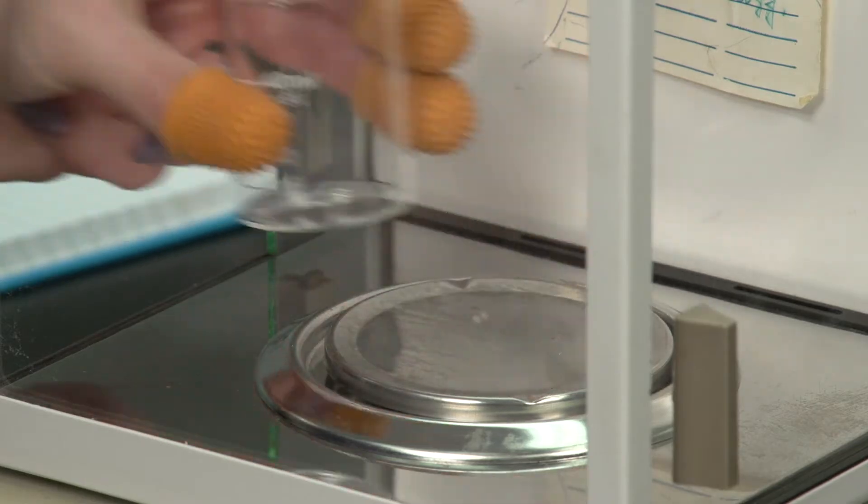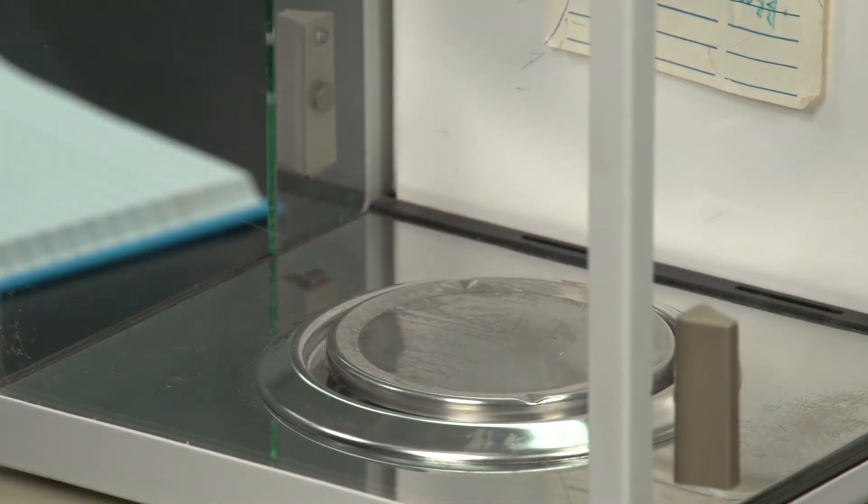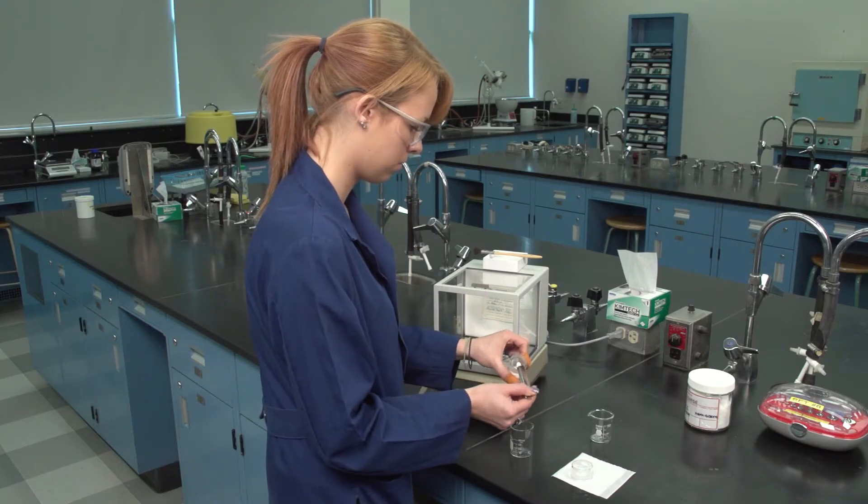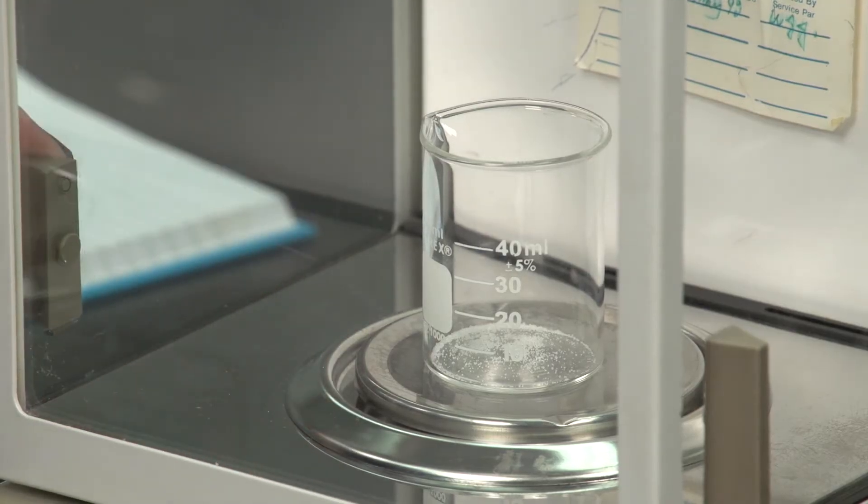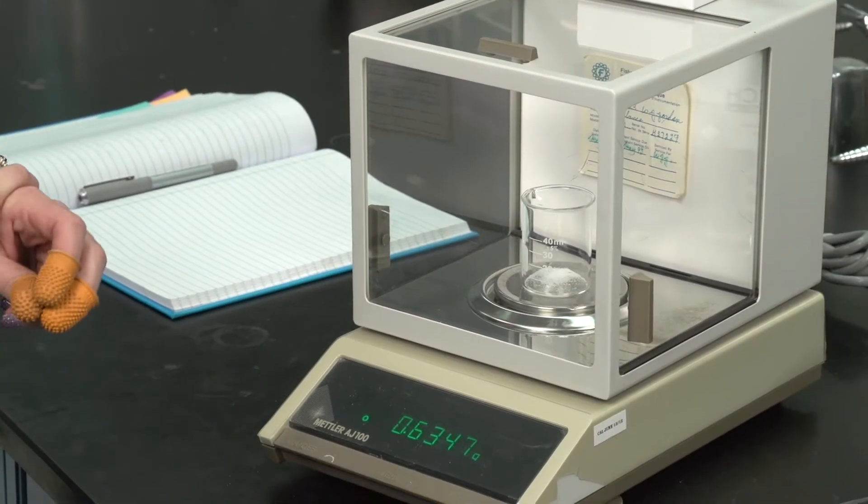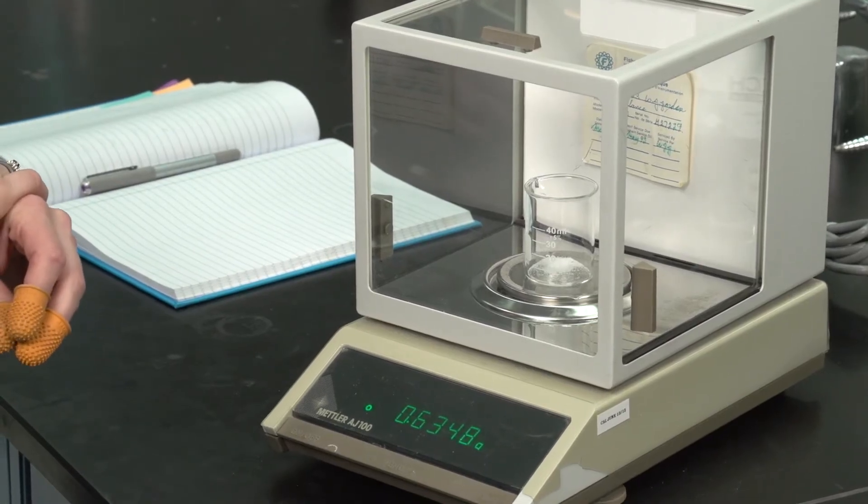Remove the weighing container from the balance. Add the substance to be weighed using a spatula or scupula. Replace the weighing container and contents on the balance pan. Close the compartment door and allow the balance to equilibrate. The mass indicated on the balance readout is the actual mass added.